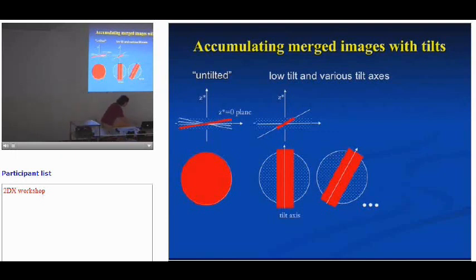And that would look something like this. Okay, so when you are done with that procedure, the volume that you have information in, in the reciprocal space, has expanded, so that it gives you more like a band of information up to that tilt.